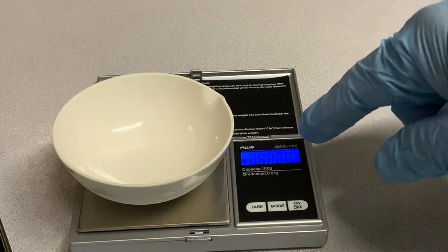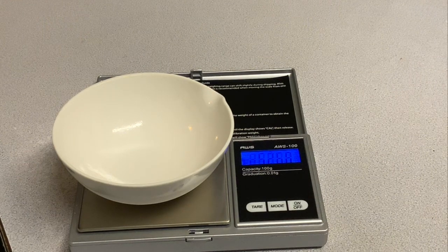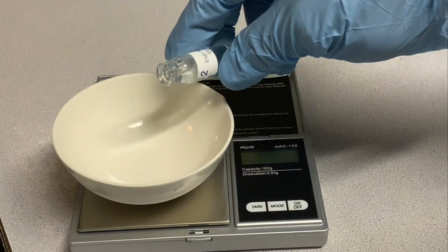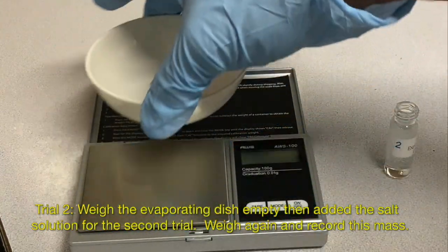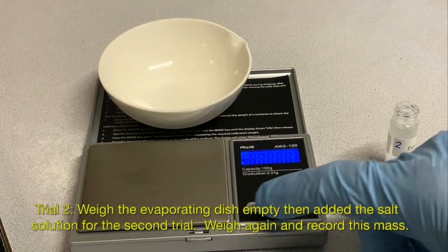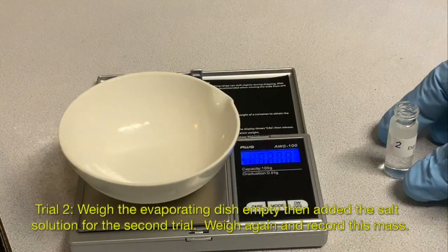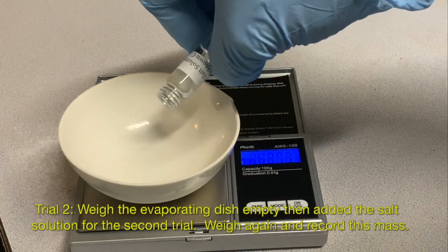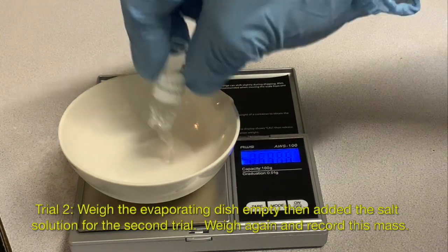And I have my mass on my scale, and then I'm just going to add the salt solution. When I add the salt solution, I'm going to add all the salt solution to the evaporating dish.